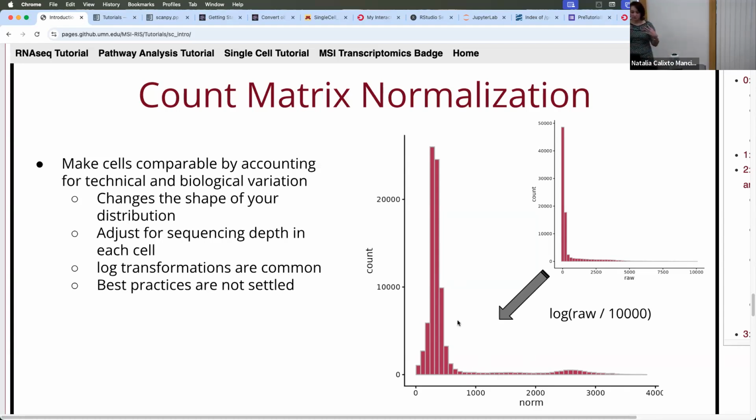to better use the quantified hits in the counts matrix, but there is still discussion on what are the best practices to normalize the data. Some people think that normalizing by depth, even though it's great for getting rid of technical issues, might confound biology. So stay tuned, because what we normally do might change in the future.